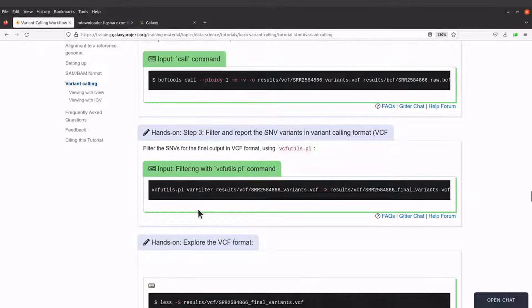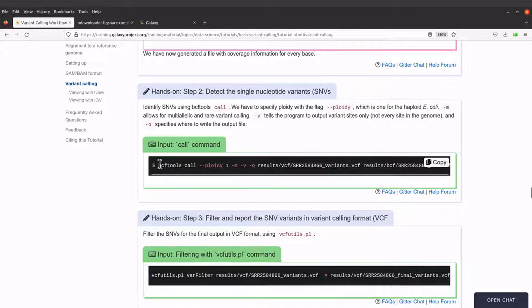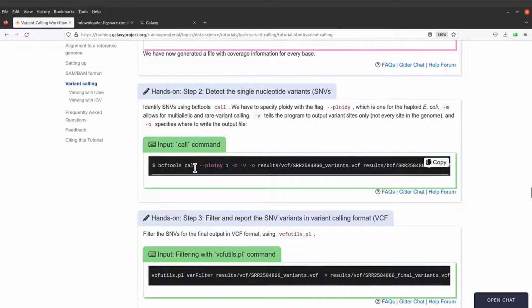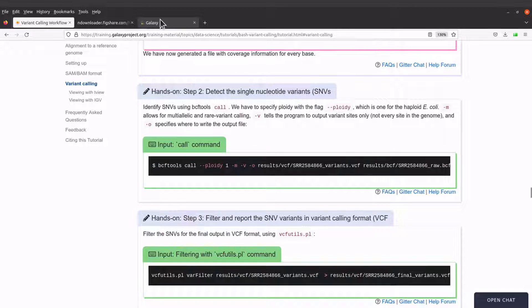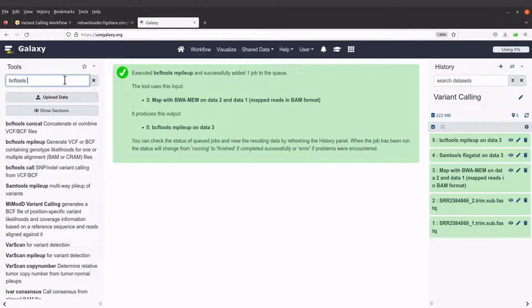We are now going to issue the bcftools call command to call the variants. So let's go back to the Galaxy page.